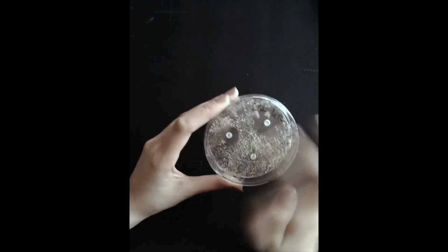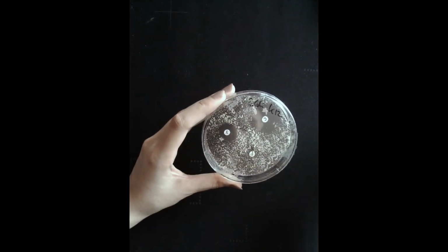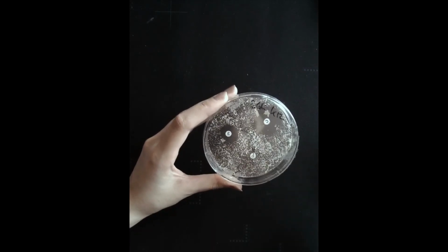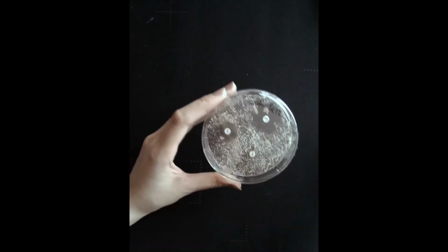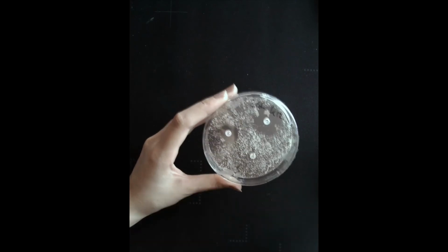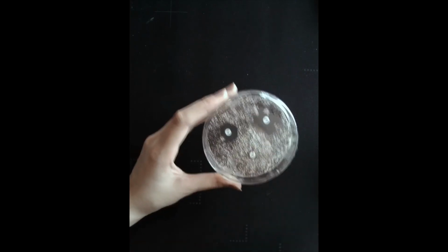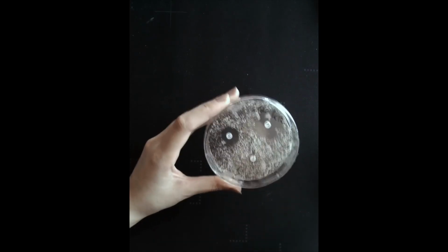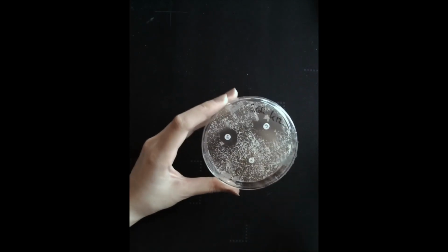The rings that you see represent the inhibition zone. This is the clear zone around the paper disc where the bacteria have been killed. So the larger the inhibition zone, the more effective the antibiotic is. And we can see that antibiotic C has got a larger inhibition zone, so therefore is more effective. But in order to be more accurate, we can calculate the area of the inhibition zone using the diameter.